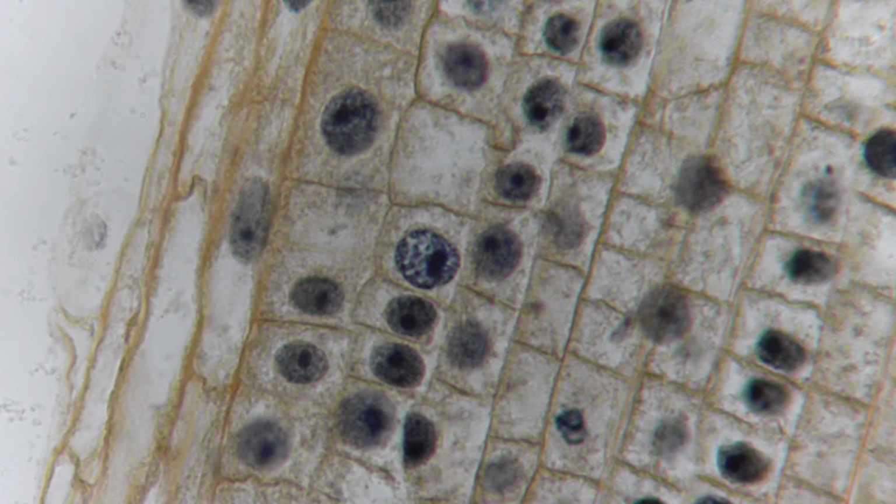Okay, I'm going to shut this off, but you can back it up. You can replay it. And on a practical, there'll be one of these, and they'll say, what phase is this? And there could be a pointer and said, what is the structure at the end of the pointer? So be sure you know where the cell wall, the cytoplasm, the nucleus, the nuclear membrane, the chromosomes, and all those parts that are bold-faced.